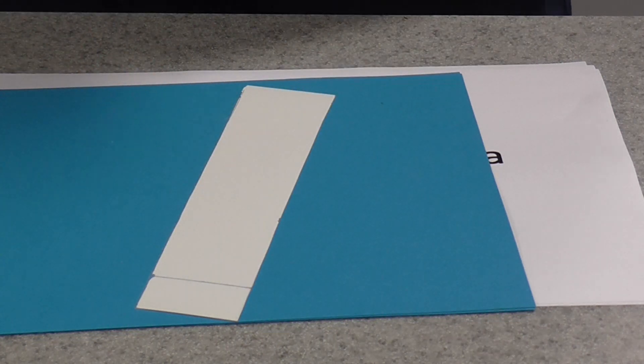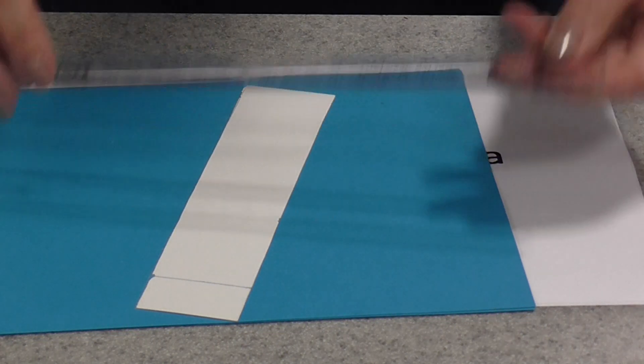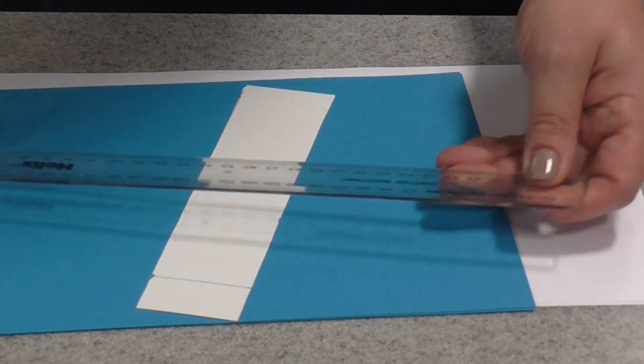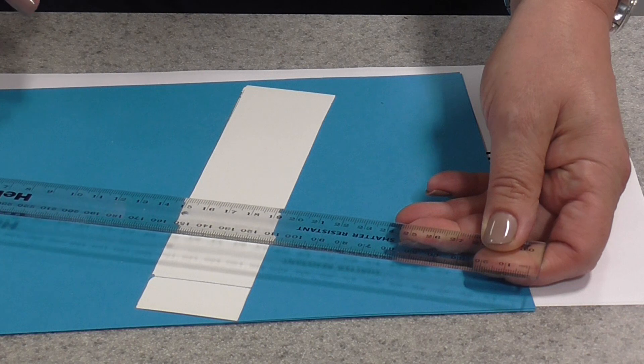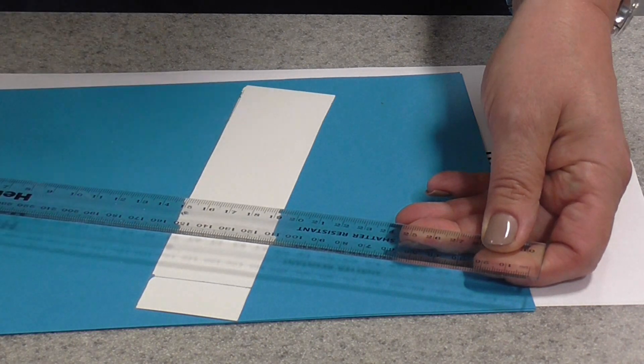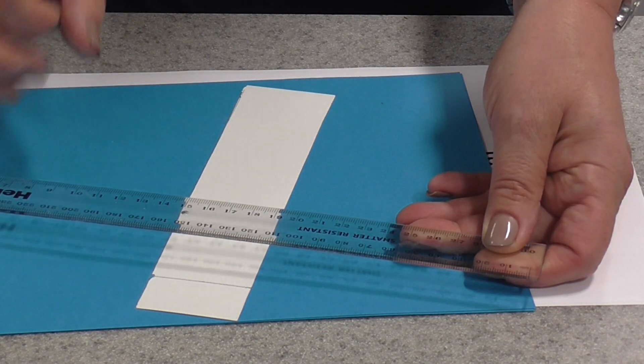When you've cut your strip, get your ruler and a pencil. It must be a pencil, not a pen. Draw yourself a line around 2 centimeters from the bottom of the strip. That will represent the origin.